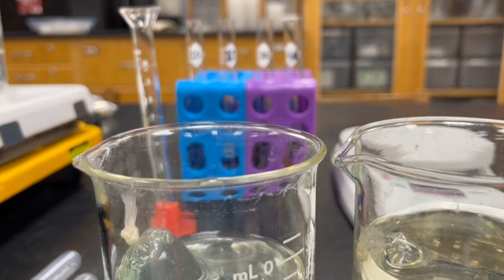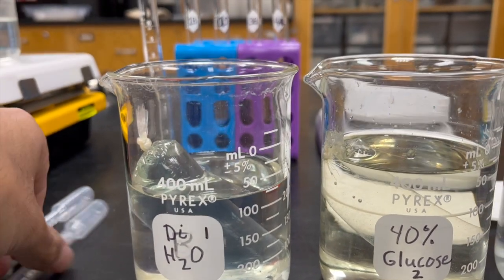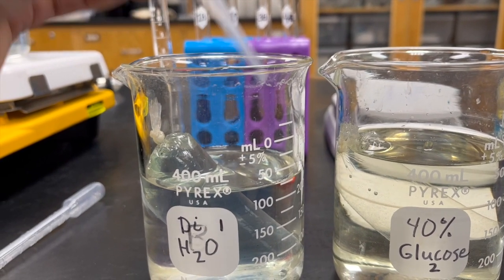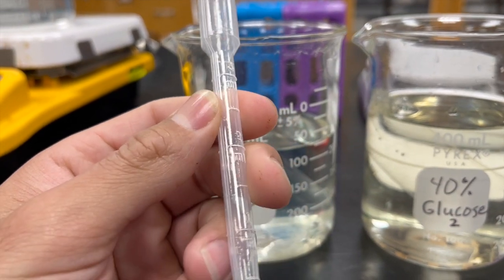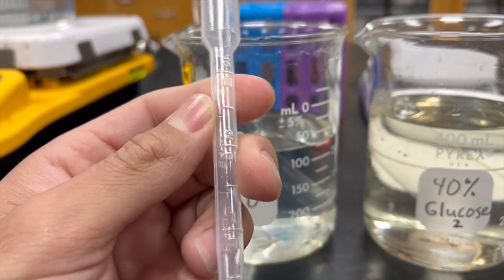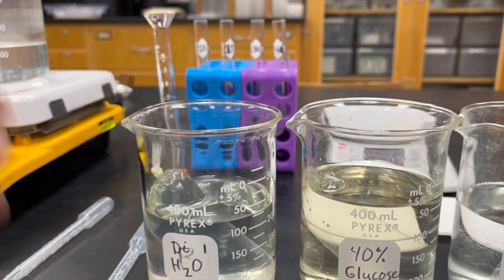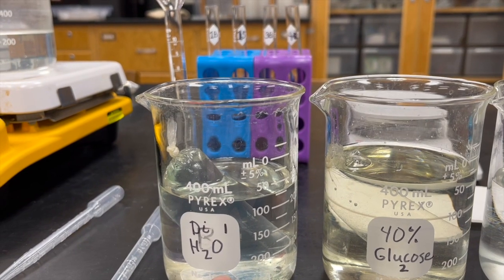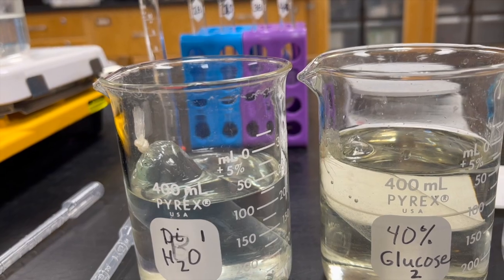Now that you already have the Benedict's in there, you're going to use these pipettes. You'll take about 4 milliliters. These pipettes have about 3, so you'll do 3 and then add an additional milliliter. For 1S, you're going to cut the sack and put that into this one.